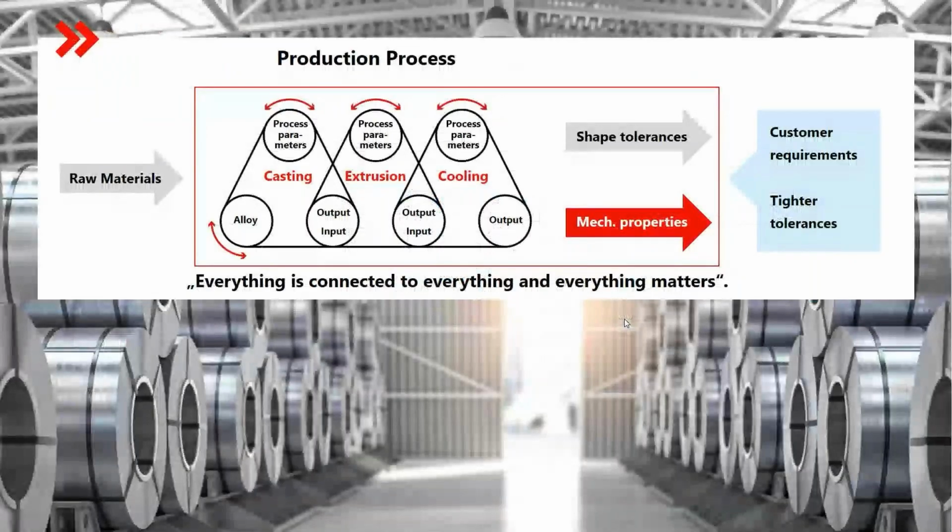And this is just a typical picture from customers who are already using these kinds of mechanisms, so that you have a process in your company. In this case, it's a metal-based company, but it's, let's say, a more general picture.